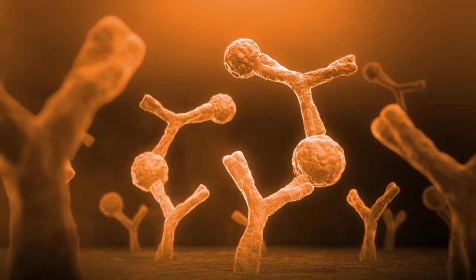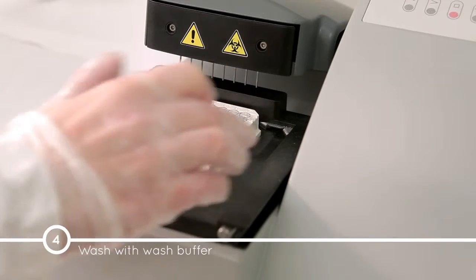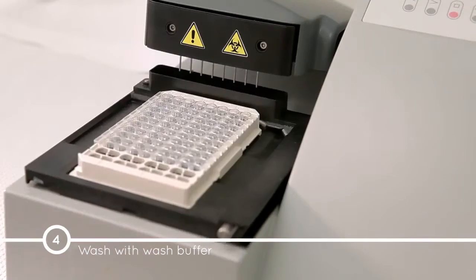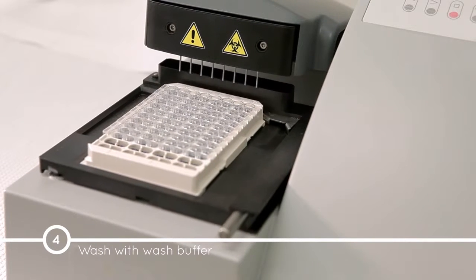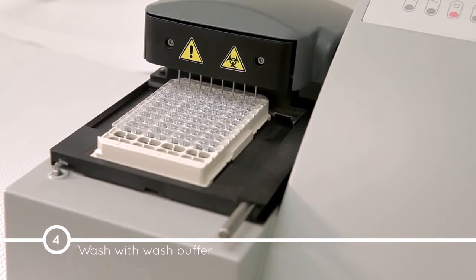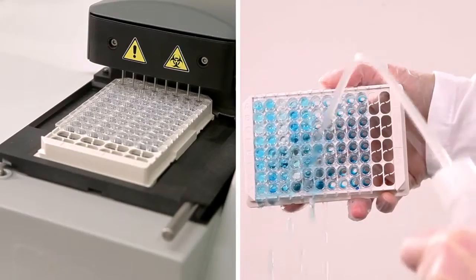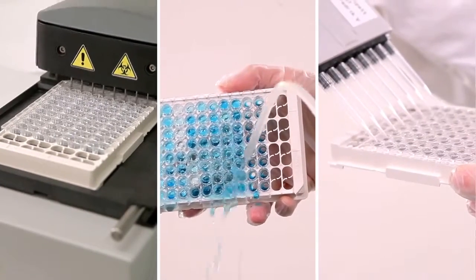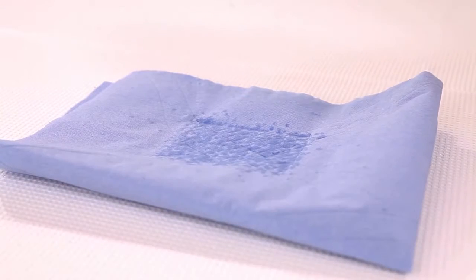After the 60-minute incubation, wash the plate 6 times with 700 microliters of wash buffer per well using an automated plate washer with overflow function. Do not include a soaking step in the wash program. Alternatively, the plate can be washed manually using a squirt bottle or a multi-dispensing pipette. After the final wash, invert and tap the plate firmly against absorbent paper.